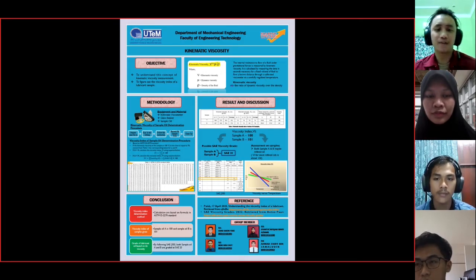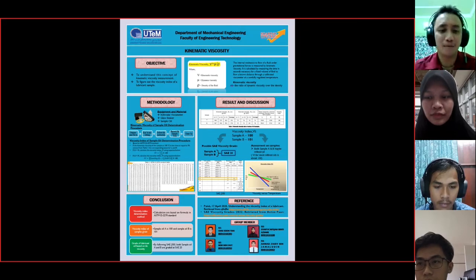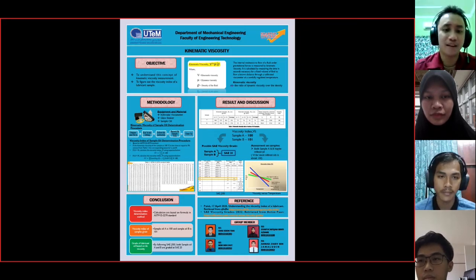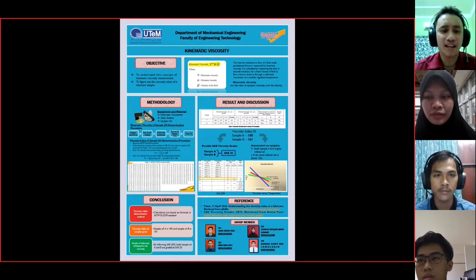When we have the basic data of kinematic viscosity, we calculate the viscosity index of the sample oil based on the ASTM D2270 standard.